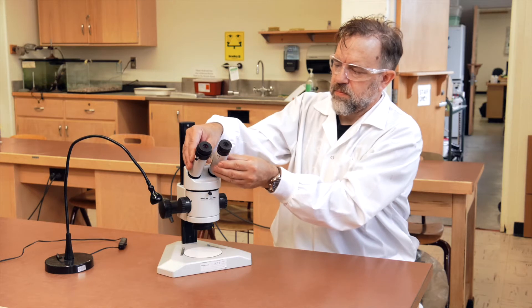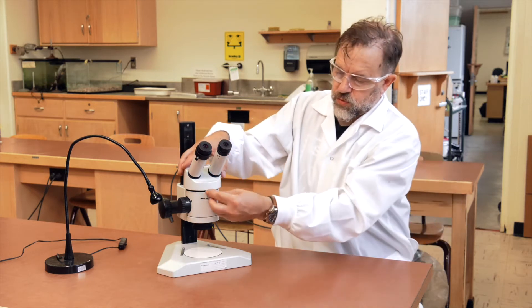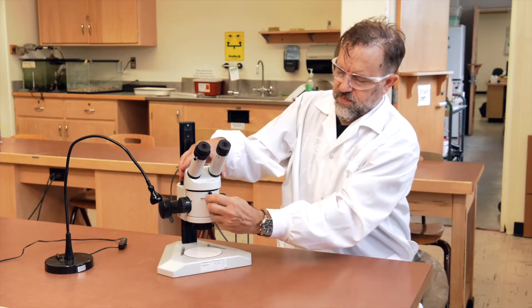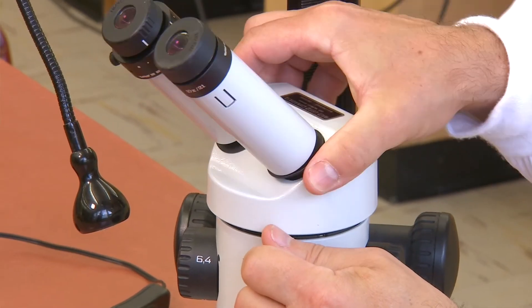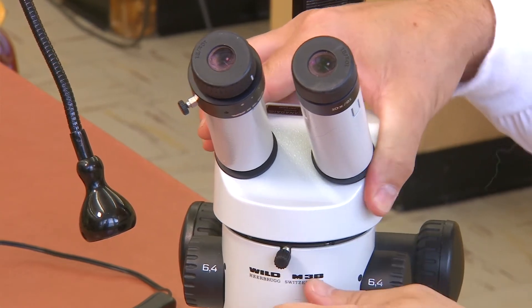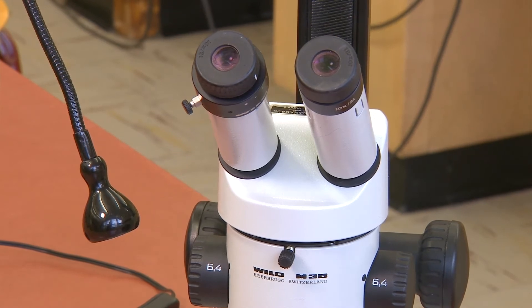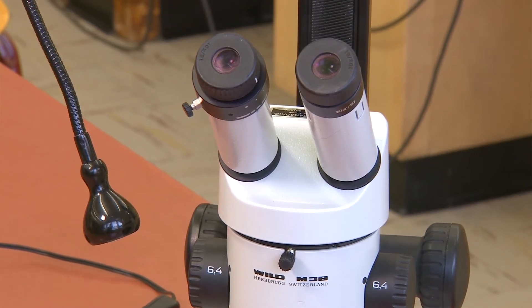The oculars are located on top of the binocular tube. At the side may be a clamping screw. Loosening this allows the binocular tube to rotate. For the purposes of this lab, the clamping screw should be left tight. A loose binocular tube can allow parts to fall off, damaging the microscope, you, or your sample.